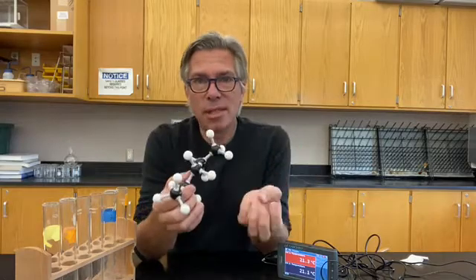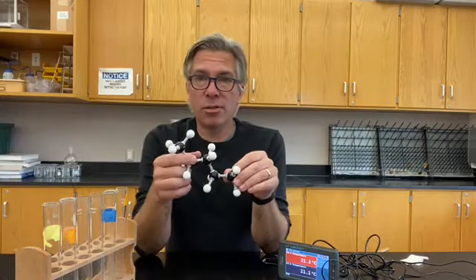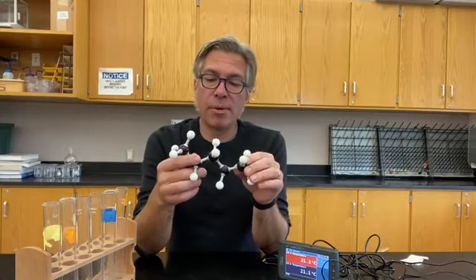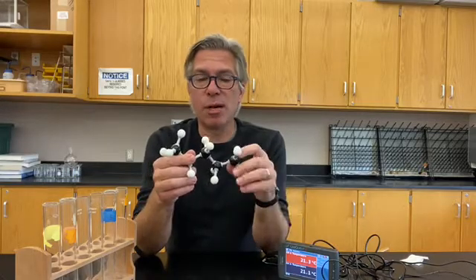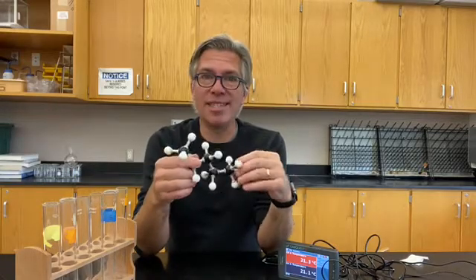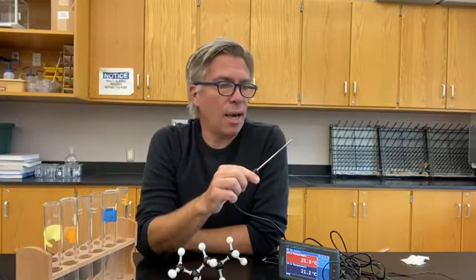Evaporation is the process in which a molecule leaves its neighbors in the liquid state and enters the vapor state above it. So it might make sense that the stronger the intermolecular force holding those molecules together, the less evaporation you're going to have. It might also make sense that the molecules that are evaporating have a larger kinetic energy than those in the liquid below. And so as they evaporate, they take energy with them, and the result is that the liquid below gets cooled and the temperature drops. And we're going to measure that change using our handy dandy little probes here and see how much the temperature drops when different liquids evaporate.